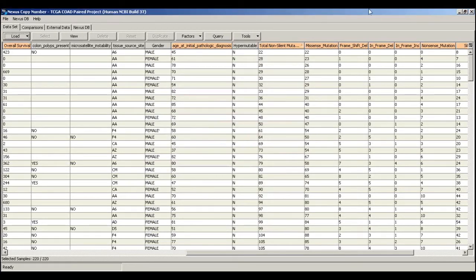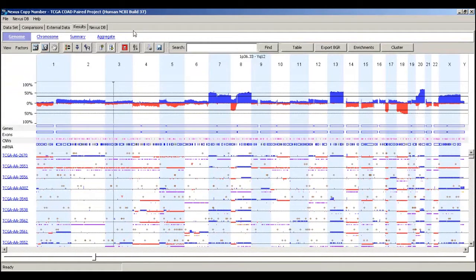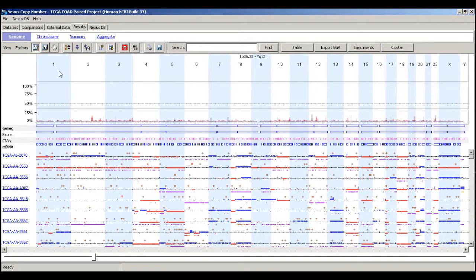So we've looked at this data in terms of the overall mutational spectrum, but what about looking at some of the individual mutations to see if there's anything of interest? What we can do here, I can remove this flag. We can change our view now to be the sequence variants. Now we're showing on the top panel an aggregate view of just the sequence results. And just like before, we can scroll through this data to see if there's anything of interest.